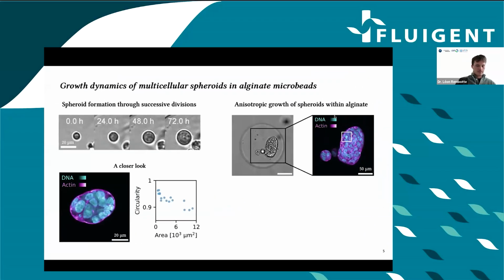So this was all done with HEK cells, which is a widely used cell type, but also a very robust cell type. So this made things easier, but we then checked with other cell types, such as MDCK cells, which are widely used for epithelial tissue modeling, and also hiPSC cells, so induced pluripotent stem cells. They both passed the test of being completely alive after encapsulation, meaning that our general technique is compatible with encapsulation of much more fragile cell types.